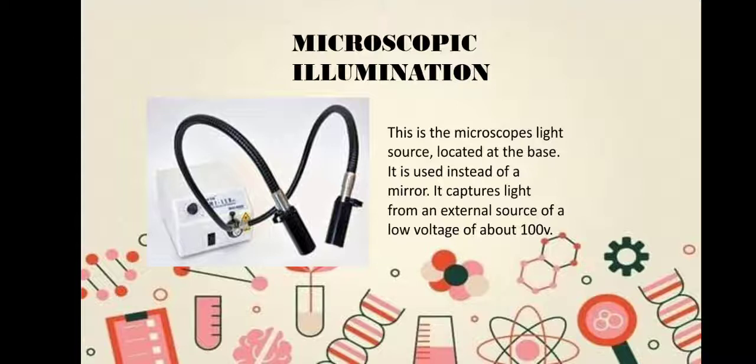The illumination system of the standard optical microscope is designed to transmit light through a translucent object for viewing. Typically, the condenser focuses the image of the light source directly onto the plane of the specimen, a technique called critical illumination.